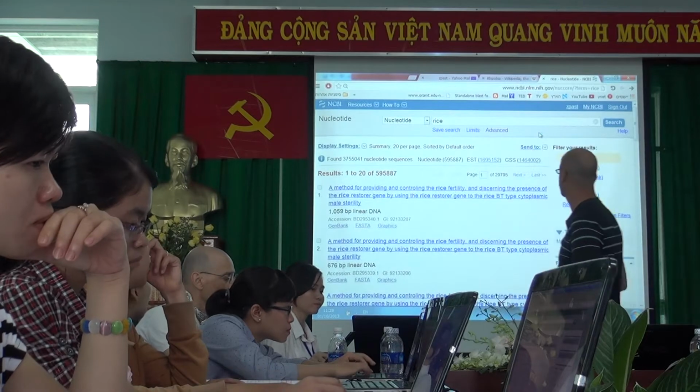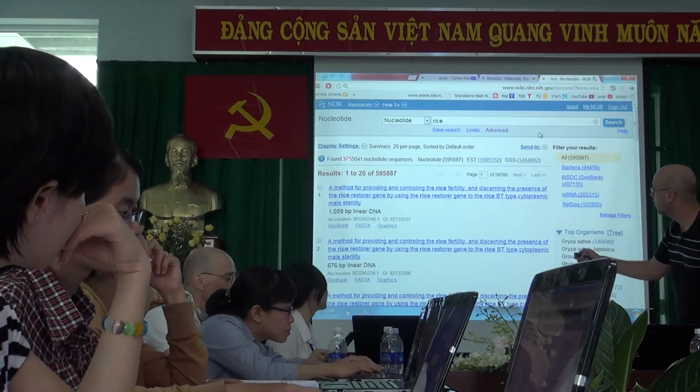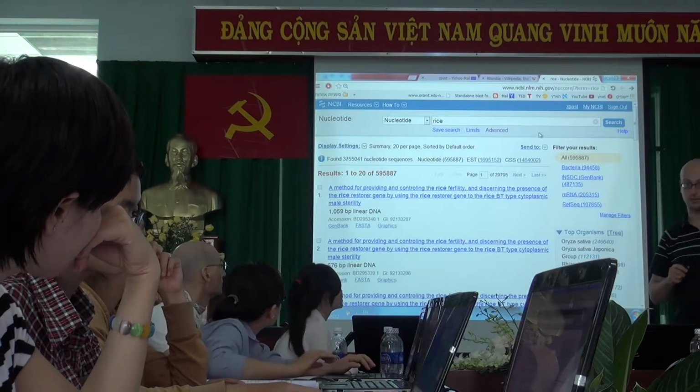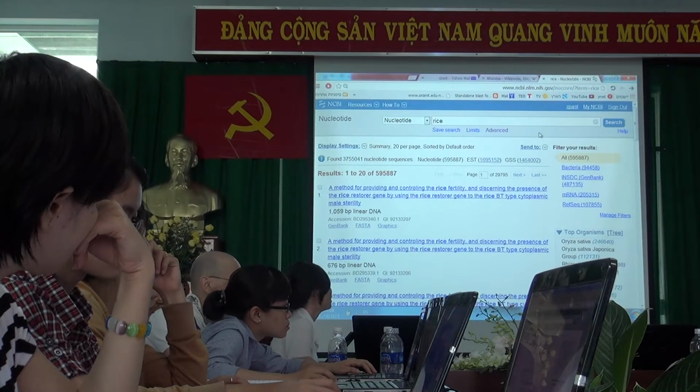Let's try it out. I get almost 4 million sequences.